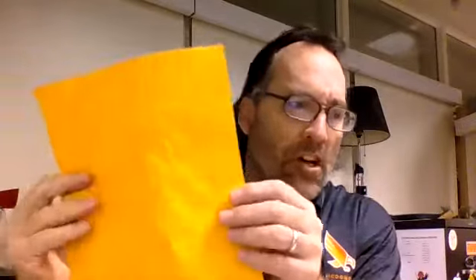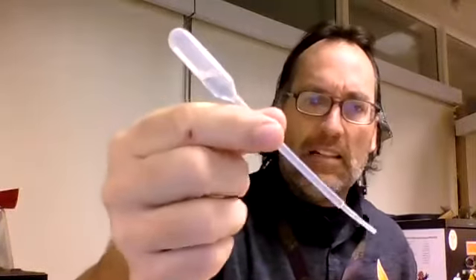All right, our next one is going to be with this piece of paper right here, kind of an orangey color paper. And I'm also going to take ammonia again. Remember the clear solution that we added with the copper sulfate? And I have that in a small pipette. You can kind of see that there.